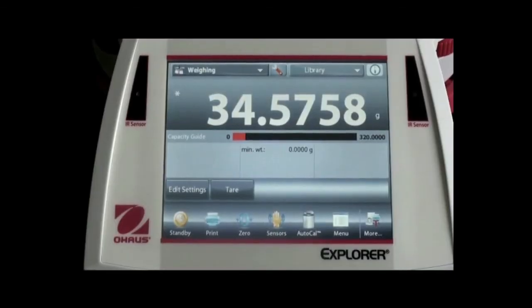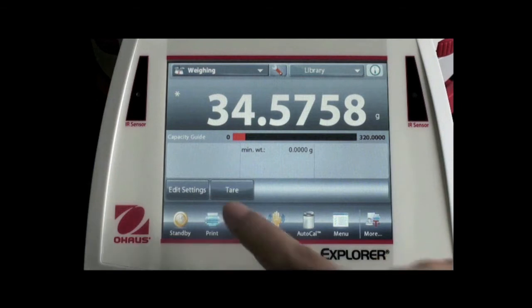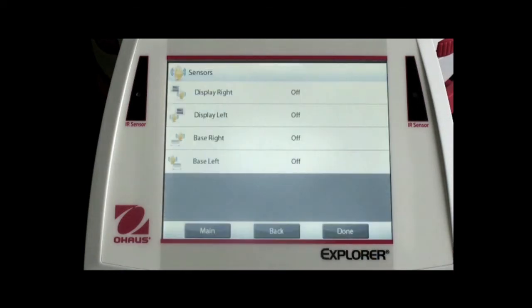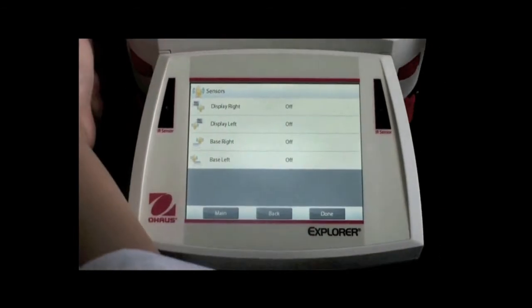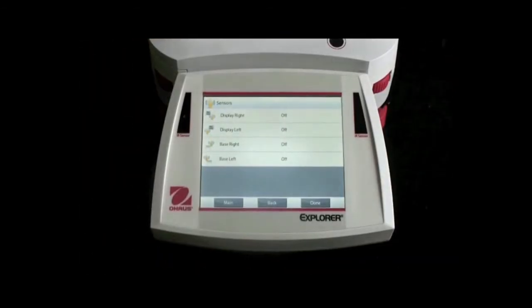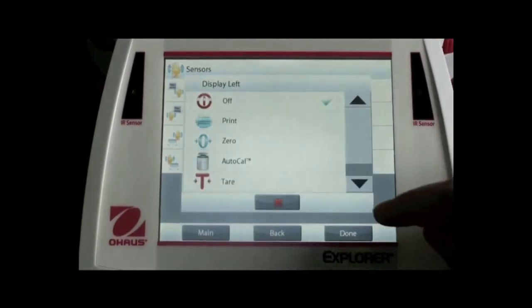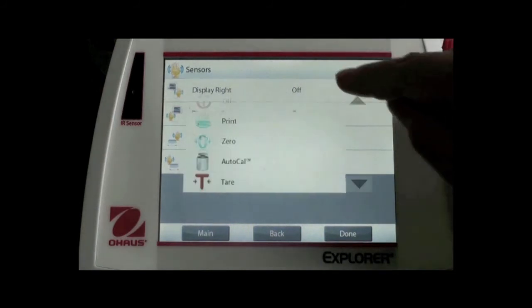The bottom line is a frequently used line. Seven buttons are ready to be used. For example, if you push zero, the balance will immediately be zeroed. We also have a sensor button, which allows you to independently set up four sensors — two on the terminal and two on the base. For example, I can set the left terminal sensor as zero function, and the right one has print function.